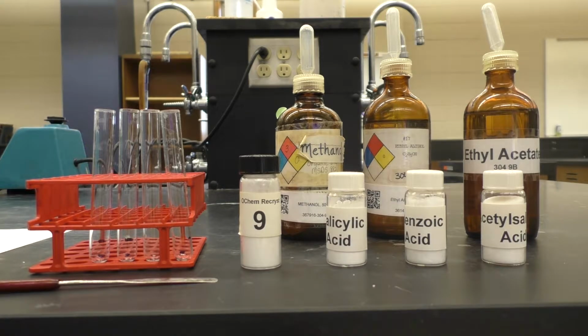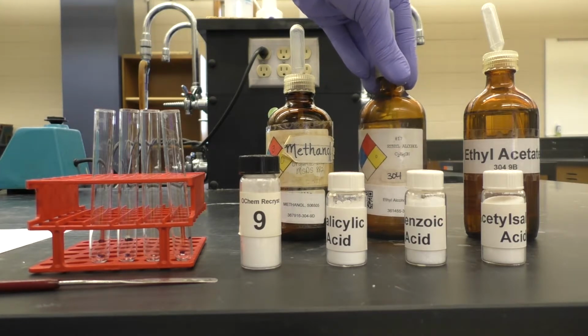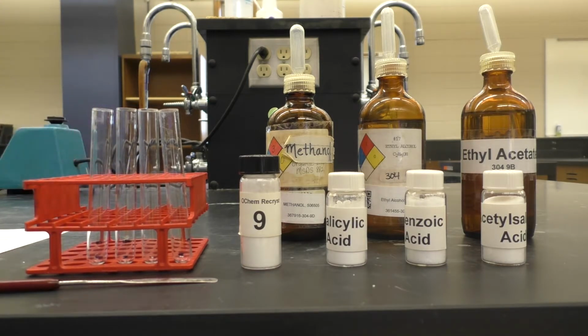And when you start to do recrystallization, the first thing you have to identify is the proper solvent to do the recrystallization in. Now sometimes we'll have to do mixed solvents for certain recrystallizations. Here we should be able to get away with a single solvent recrystallization. And I've got several possible solvents here. I've got methanol, ethanol or ethyl alcohol, and ethyl acetate. And then I'm also going to use water as a fourth solvent, distilled water.